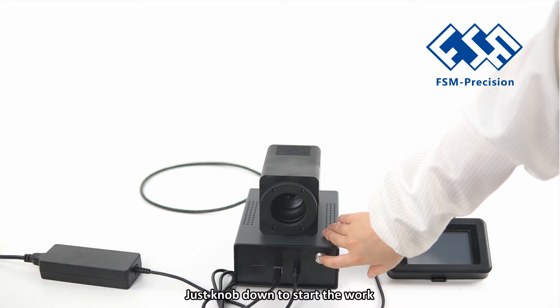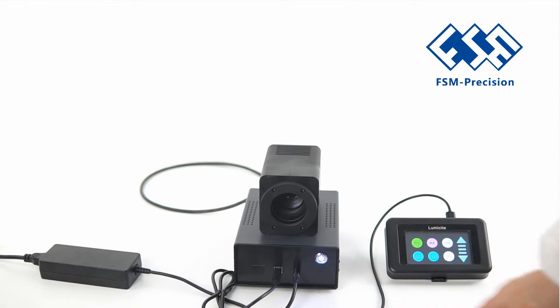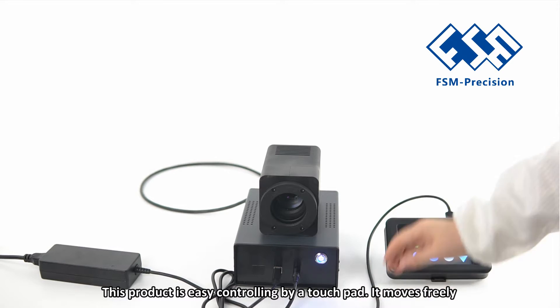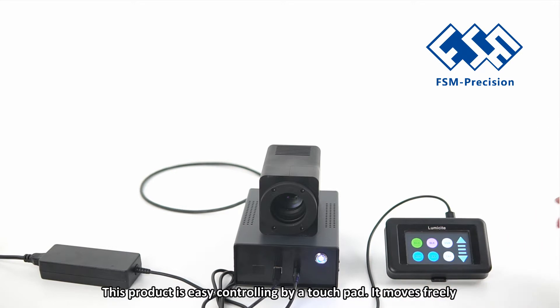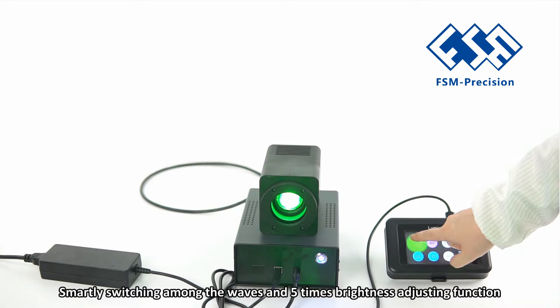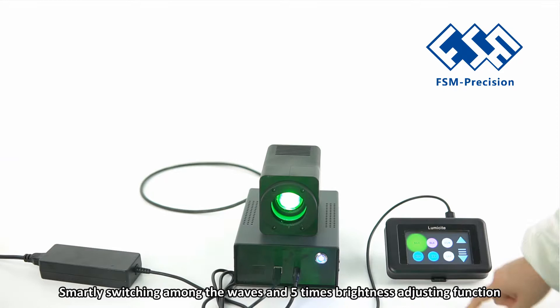Just knob down to start work. This product is easy to control by touchpad. Smartly switching among the wavelengths with a 5-level brightness adjusting function.